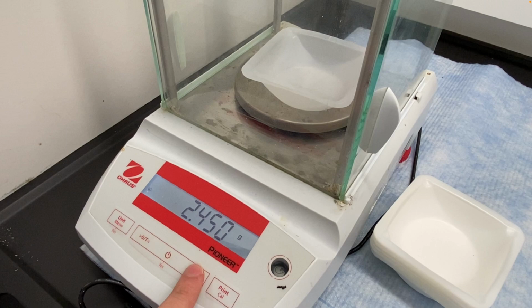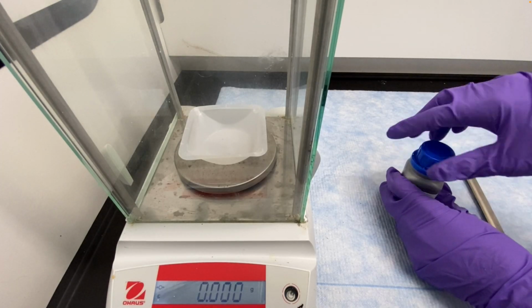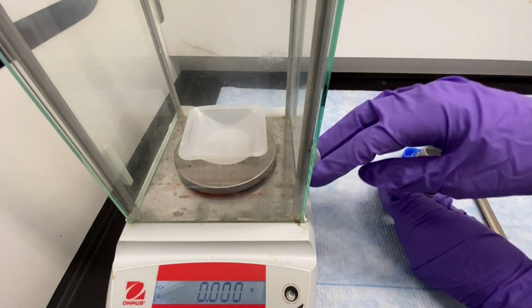You don't actually care about the mass of the weighing boat that's on the balance. What you really care about is the mass of the chemical you're going to put in it. And so to sort of ignore the mass of the weighing boat, you do what's called taring. You can see we're pressing that button, which has a sort of 0/T. When you press that, it ignores anything that's on the balance and sets the mass to 0. So you tare the balance to ignore the mass of the weighing boat.